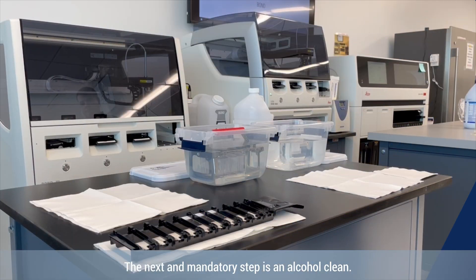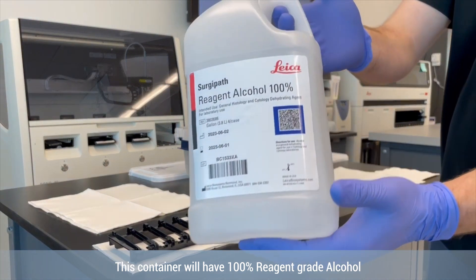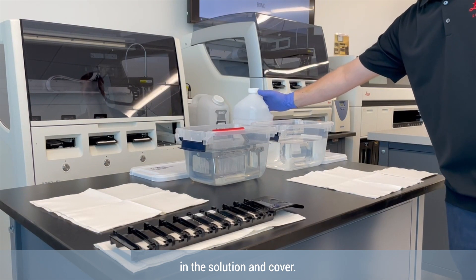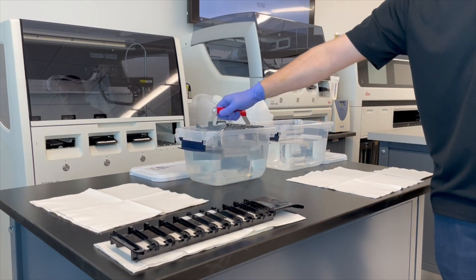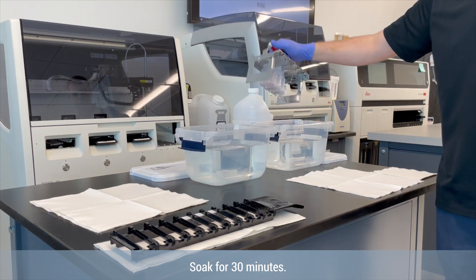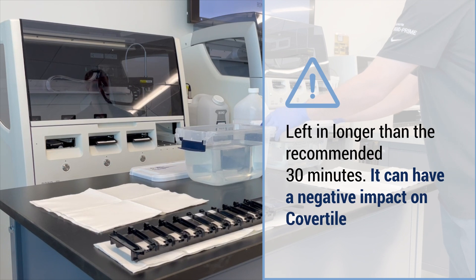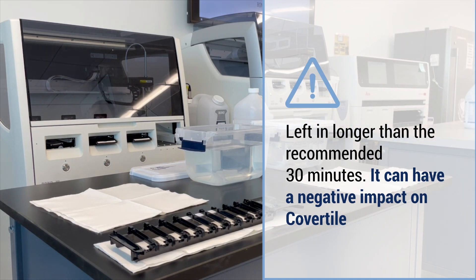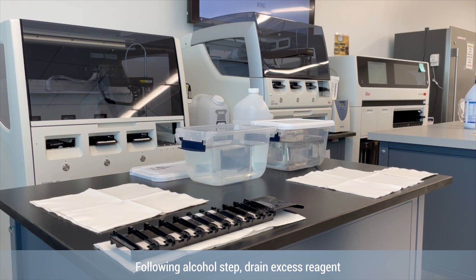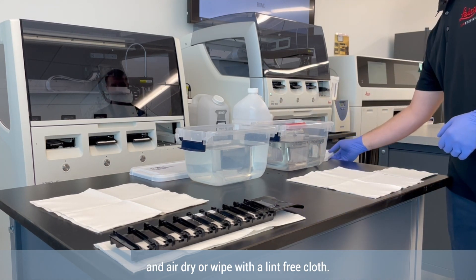The next and mandatory step is an alcohol clean. This container will have 100% reagent grade alcohol. Place the cleaning rack in the solution and cover. Soak for 30 minutes. If the rack is left in longer than the recommended 30 minutes, it can have a negative impact on the cover tiles. Following this alcohol step, drain excess reagent and air dry or wipe with a lint-free cloth.